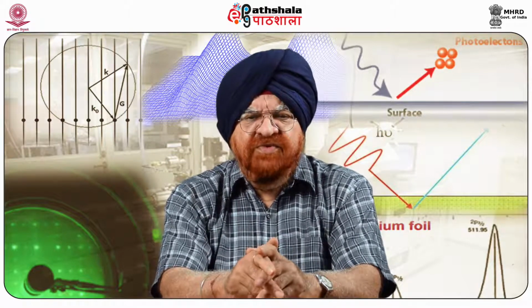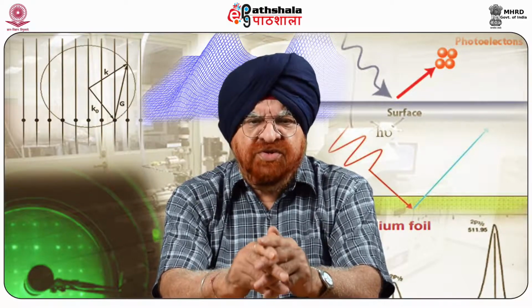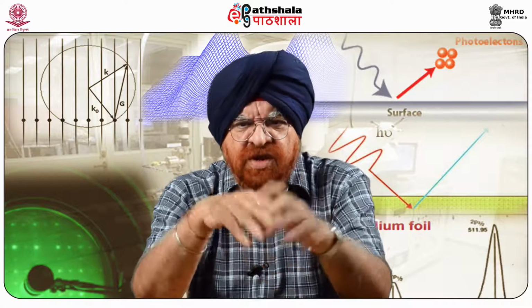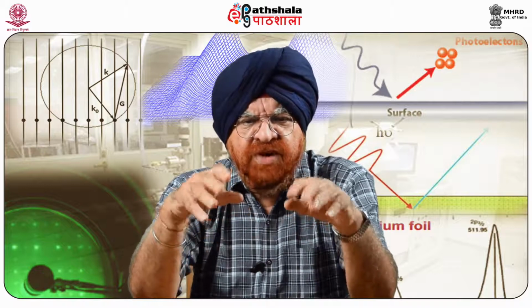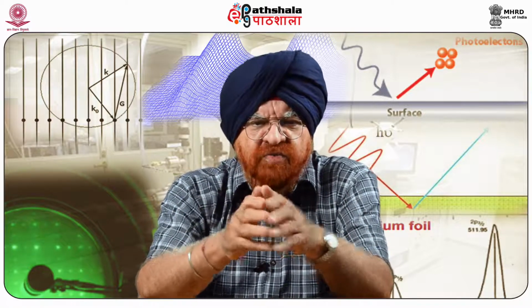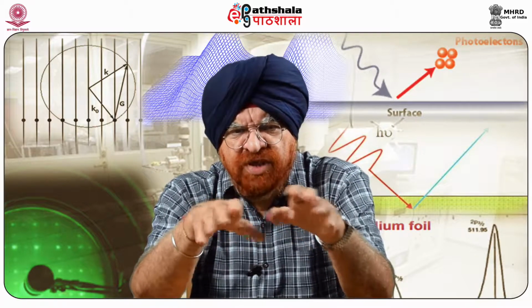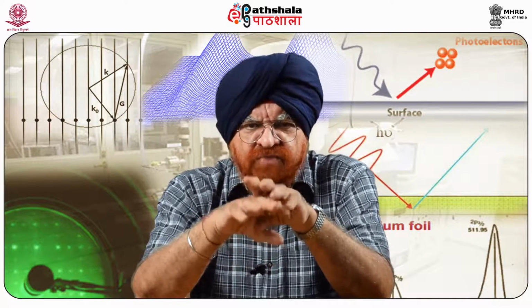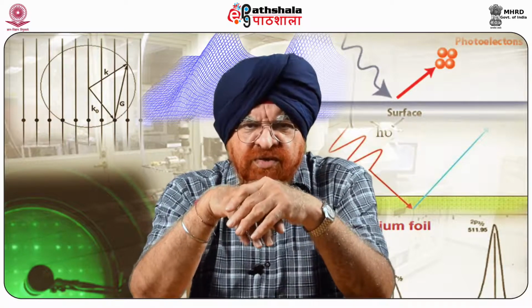Now, in CFM imaging, an increase in the friction as an AFM probe is scanned across a membrane surface corresponds to an increase in adhesion between the probe and the membrane surface. Because the magnitude of the measured adhesion is a function of probe and membrane surface energetics, it is possible to map the spatial distribution of membrane surface chemistry using CFM, where both normal and lateral deflection of the AFM cantilever are measured.